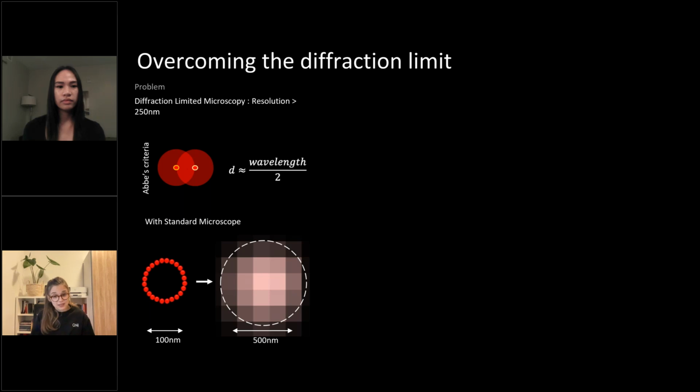What else is the limitation? Not only can we not distinguish them, but for example, for a structure that is 10 nanometers in size or 100 nanometers in size, we would not be able, based on the signal, to distinguish which is which. So everything below that diffraction limit will appear as a big blob, and we will not be able to distinguish nanoscale features.